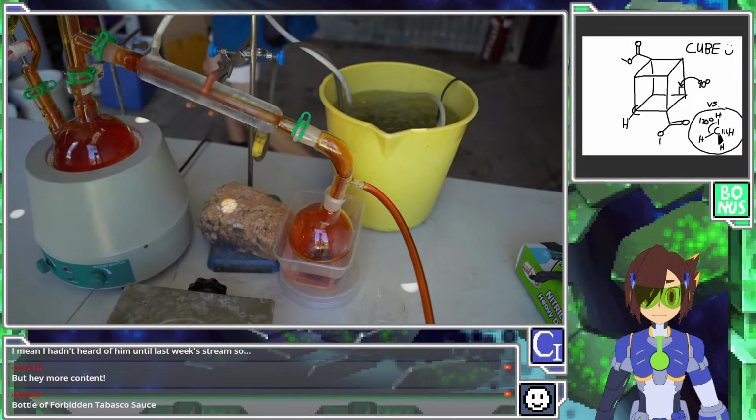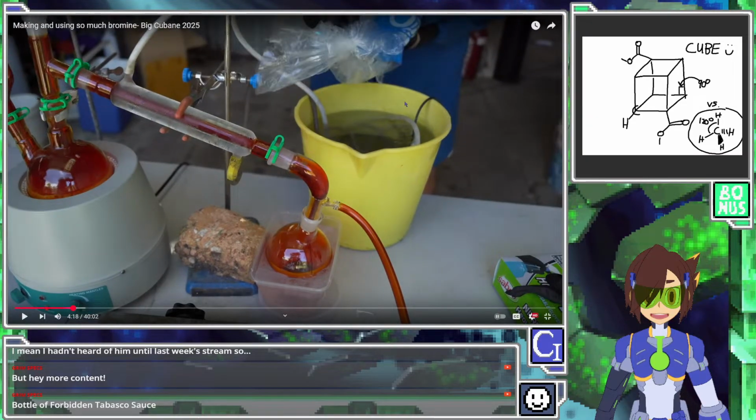And for that, we needed to convert. Just look at that. I love that about bromine. It's a liquid, but you're going to see the fumes everywhere. It's going to coat everything that you are trying to contain it in. God, the fumes of bromine are just so threatening on their own.